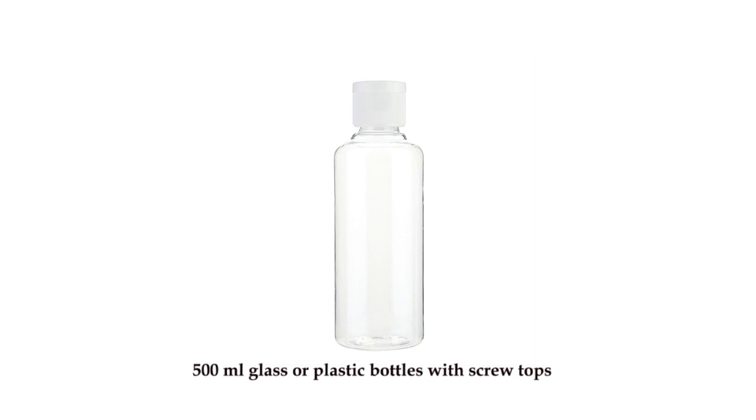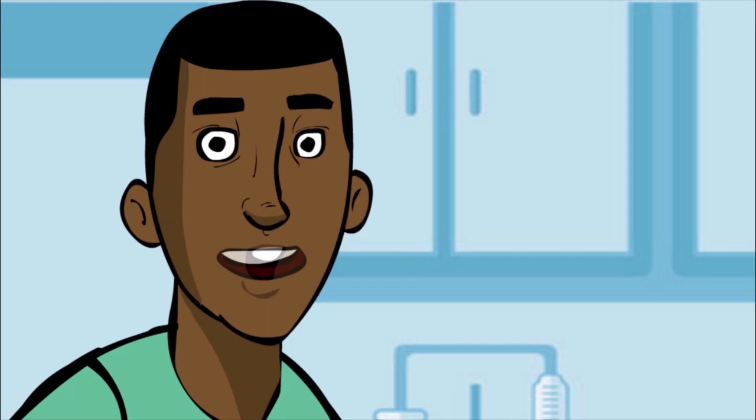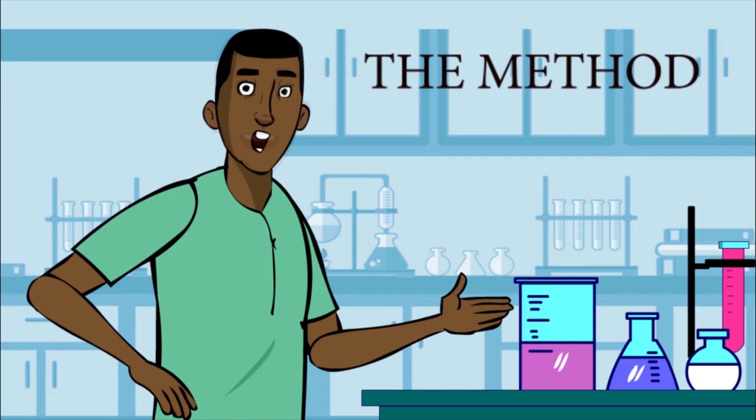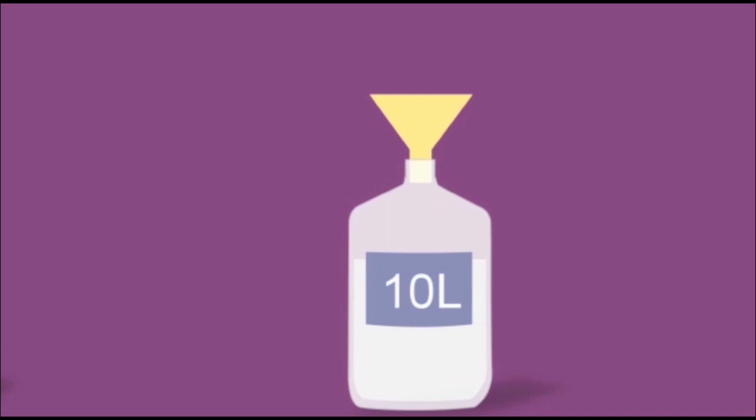The method: measure all the ingredients. Pour the alcohol into the large container. If you are going to be using the same alcohol types and containers for production, you could mark the container with the level of alcohol volume needed for ease of measuring.